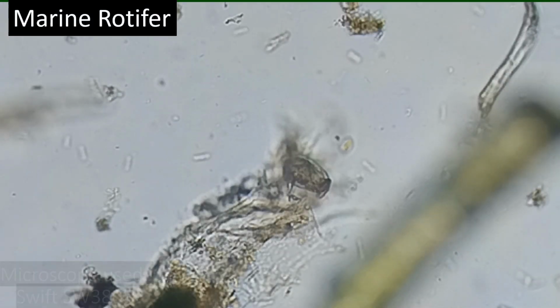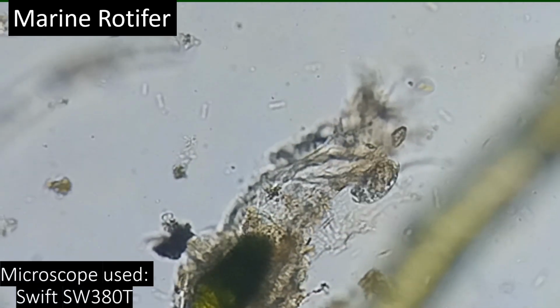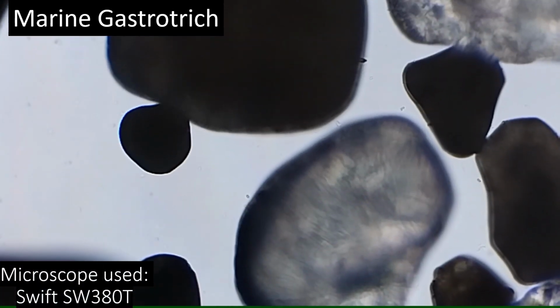I also saw this marine rotifer. It likely belongs to the class Monogononta. This is a marine gastrotrich. Gastrotrichs are tiny animals which inhabit both freshwater and marine environments.